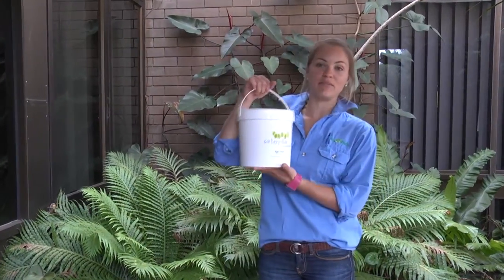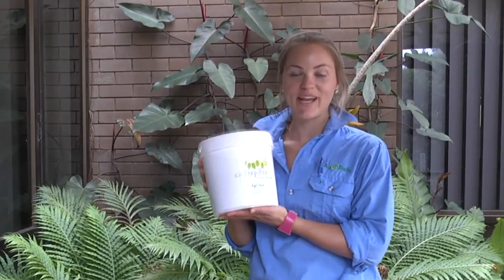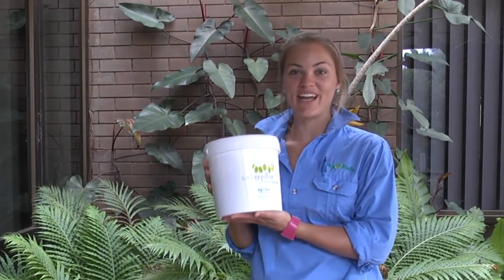Hi, welcome to Caterpillar Classroom. My name is Sophie and today I'd like to walk you through the practical steps involved in rearing Helicoverpa armigera using our Helicoverpa rearing kits. Come with me now into the classroom and I'll take you through the steps involved.